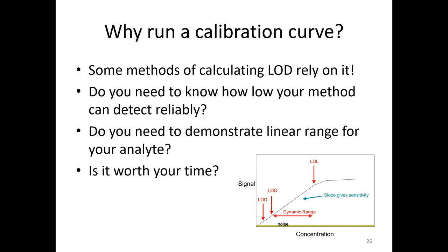calibration curve and response curve are things that some people use interchangeably. I'm guilty of it too. A calibration curve is different than a response curve. A response curve is showing the change in response of something over a range of concentrations, but it's not calibrating anything. A calibration curve is when you do pretty much the same thing, but you're using it as a calibrant to gauge a concentration or something, whether it's in the same sample or another sample. So what I really mean is response curves, because I don't know what I mean, so we'll get back to that.